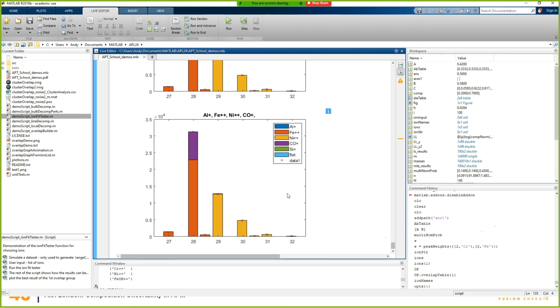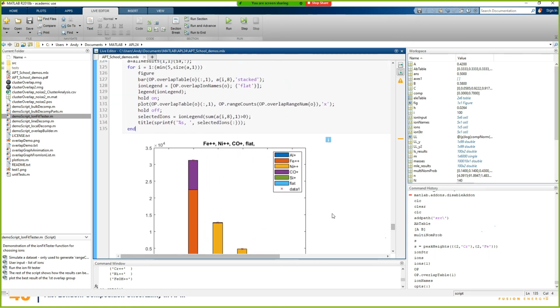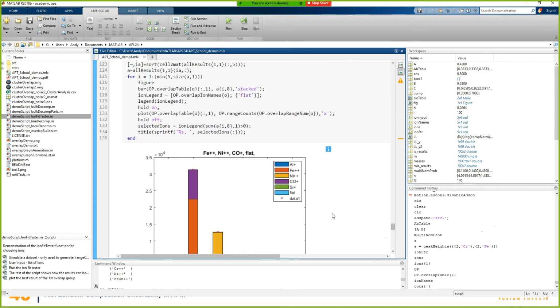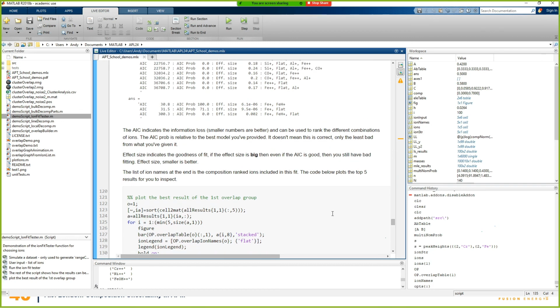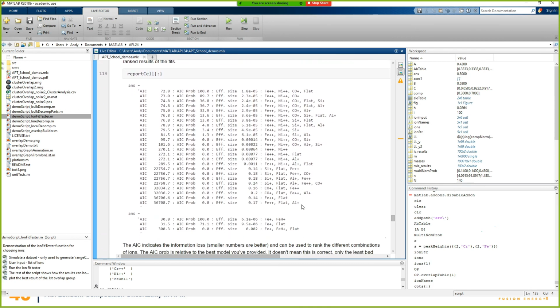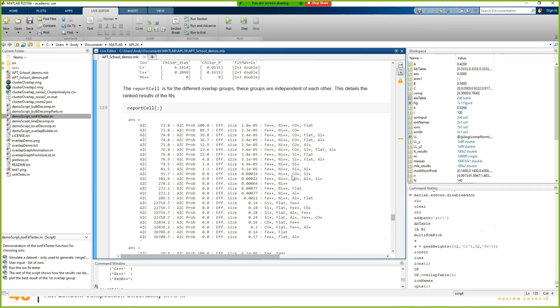And again, the important thing here is that all of these fits look the same. So if you actually did this, you'd be like, okay, I'm fairly confident now that I know what species are there, what's important, what's not important. I think this is giving Atom Probe users an insight that was previously missing when it came to choosing which ions they wanted to fit and how important different things were. Hopefully this is a function that you'll be able to use and find useful. I'd love it if this was integrated into, say, the Atom Probe toolbox, and I'd be happy to help do that.